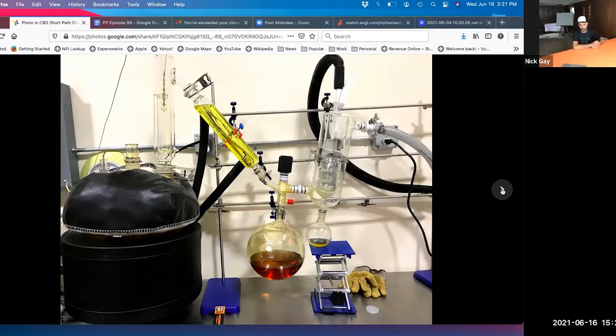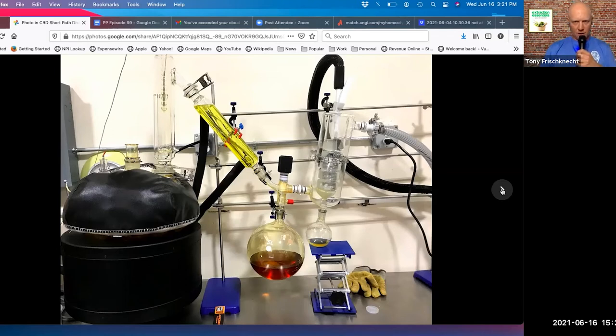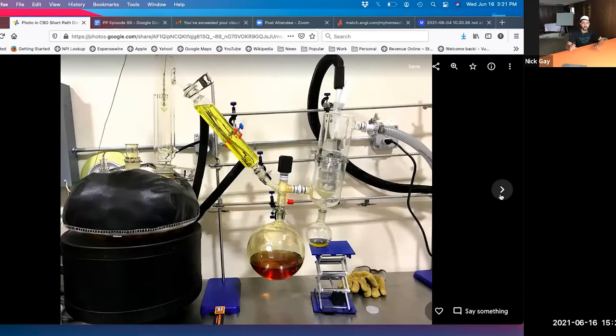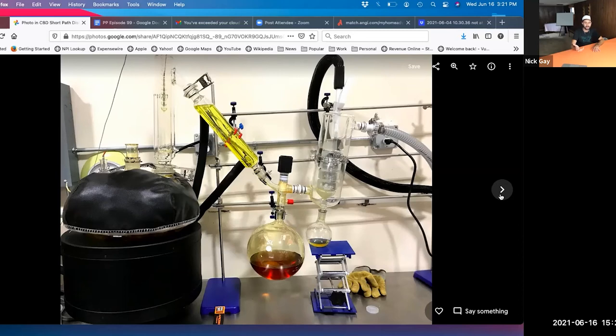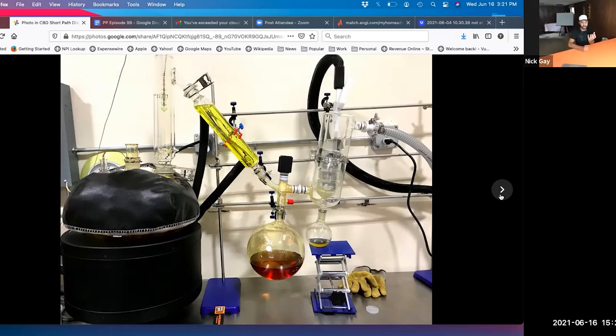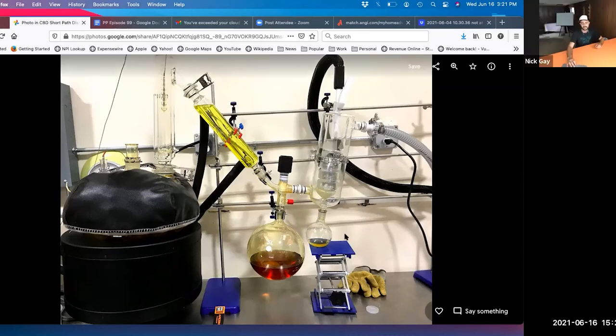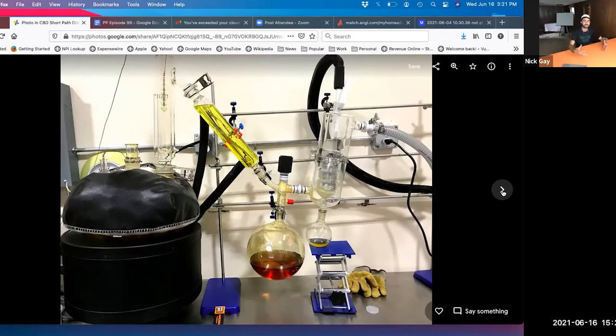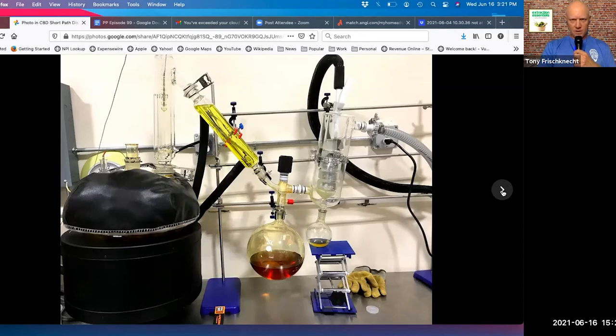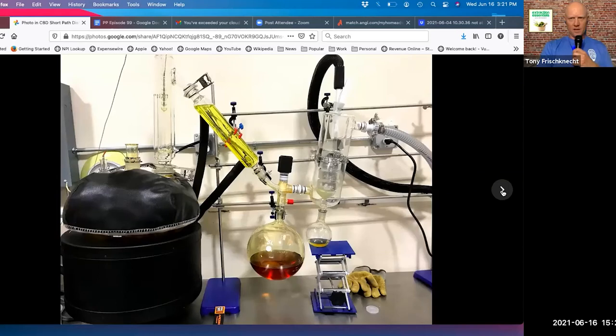Now we've got a wide shot of most of the setup where the vacuum is hanging. Now the system's running. I've actually changed out that larger bottom flask once already. I took the flask off which was the terpenes, closed off the vacuum first, put a new flask on. This flask is where we're actually collecting our wanted material, and that's our cannabis distillate. It looks a hundred times better than the black oil you dumped in.